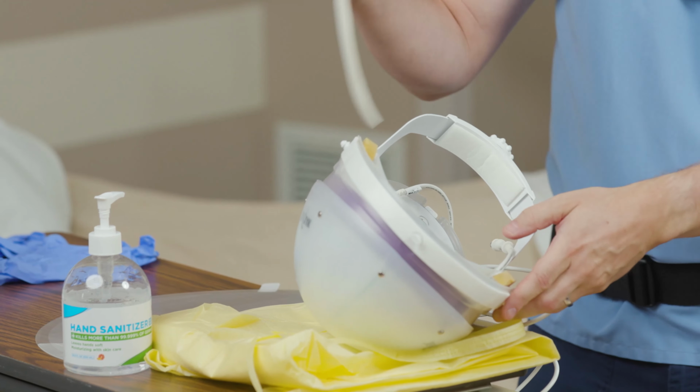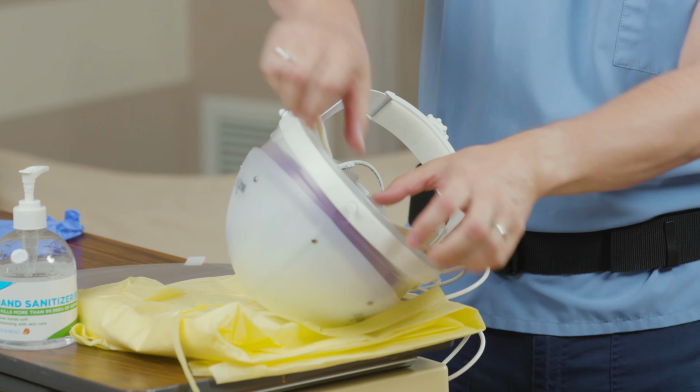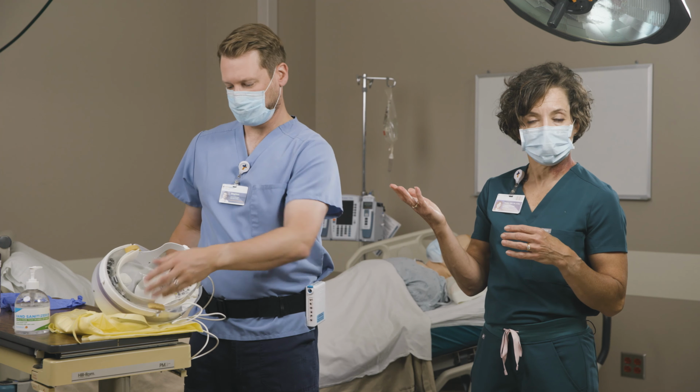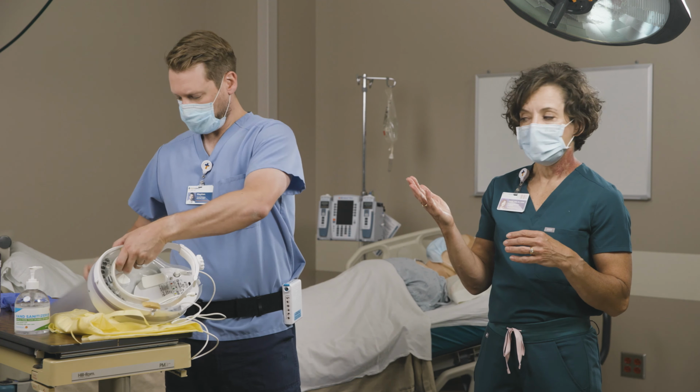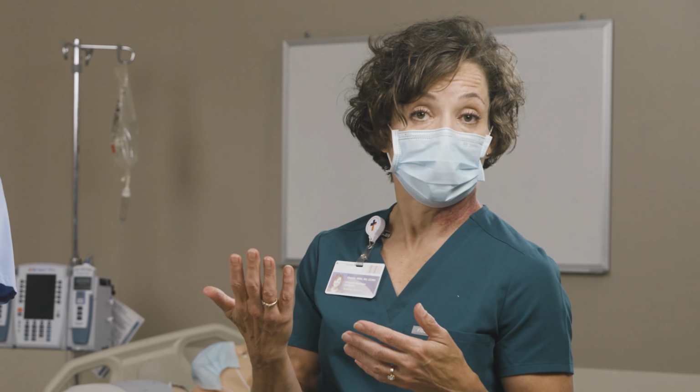He's going to put his comfort strip in his CAPR. And we assign a comfort strip at our facility for each caregiver and then write their names on it and store it in their unit so we can conserve that.